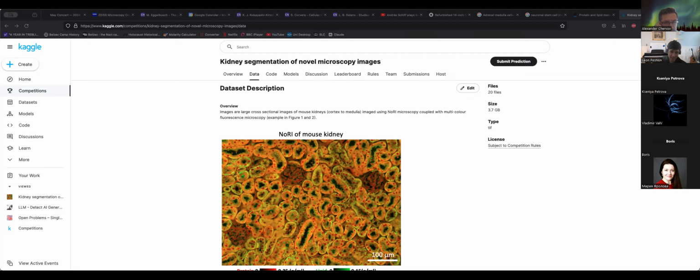This is a mosaic of tubules, and we presented just segmentation. So then each pixel has a binary attribution, generally speaking, right? It's just black and white. Either the pixel is part of the border between elements, or it is within some element, right? So if that can be solved, that's already helpful.